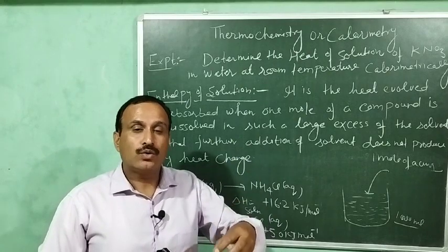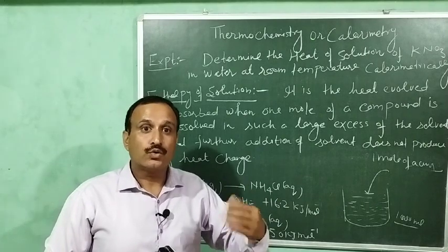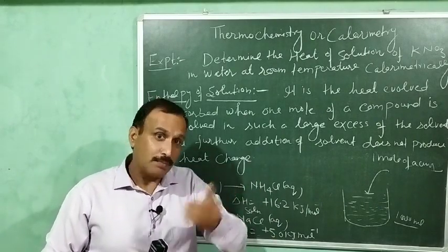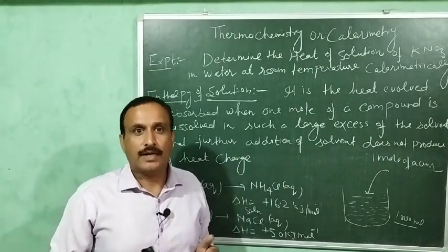जब सोडियम हाइड्रोक्साइड को या उसके 1 मोल को हम काफ़ी एक्सेस वाटर में डिज़ोल्व करेंगे तो हीट इवॉल्व होगी, और हम ये पाएंगे कि जो टेम्परेचर है आपके वाटर का वो बढ़ जाएगा, तो उसका डिसोल्यूशन एक्सोथर्मिक है.